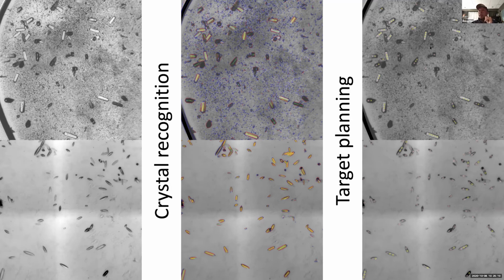But anyway, for the shots planned here, I distinguished them with two different colors. One is pink, that represents a primary shot, which means the very first shot on that individual crystal. And the yellow circles are the subsequent shots. The user may or may not want to take them.